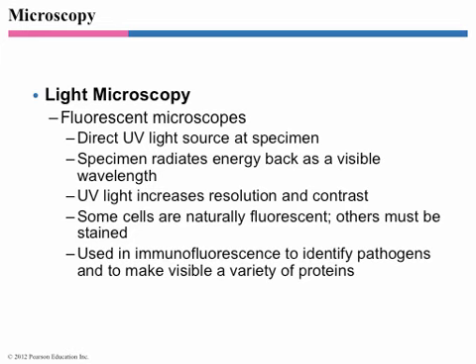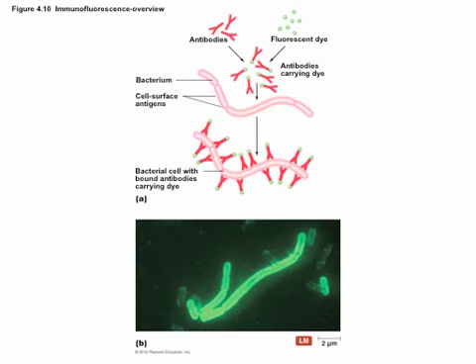Sometimes you're going to direct UV light at the specimen, sometimes you're going to direct blue light. Either way, it's going to be at an oblique angle showing across it. And usually, you're going to use antibodies with fluorophores, with fluorescent agents attached to them to see the specifically labeled parts. But more and more these days, what we're actually doing is we're creating cells that have a fluorescent protein called GFP, or green fluorescent protein, genetically linked to the bit that we want to look at.